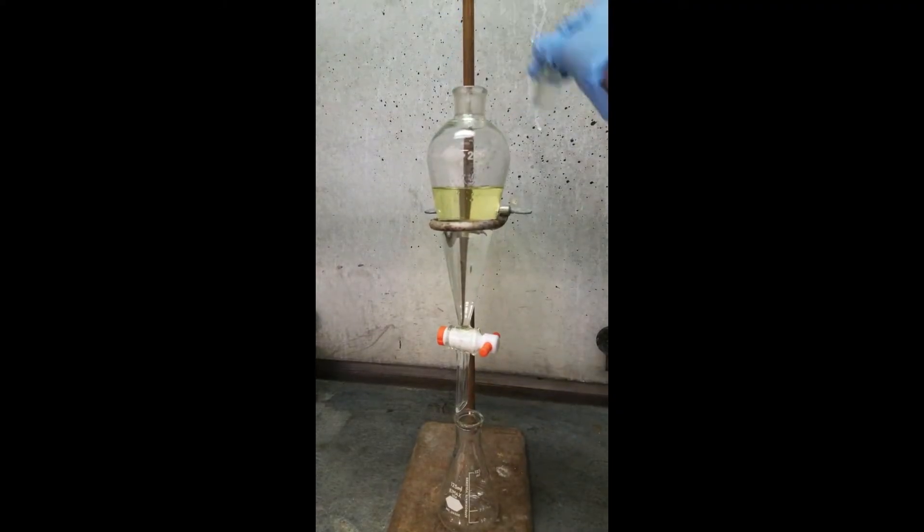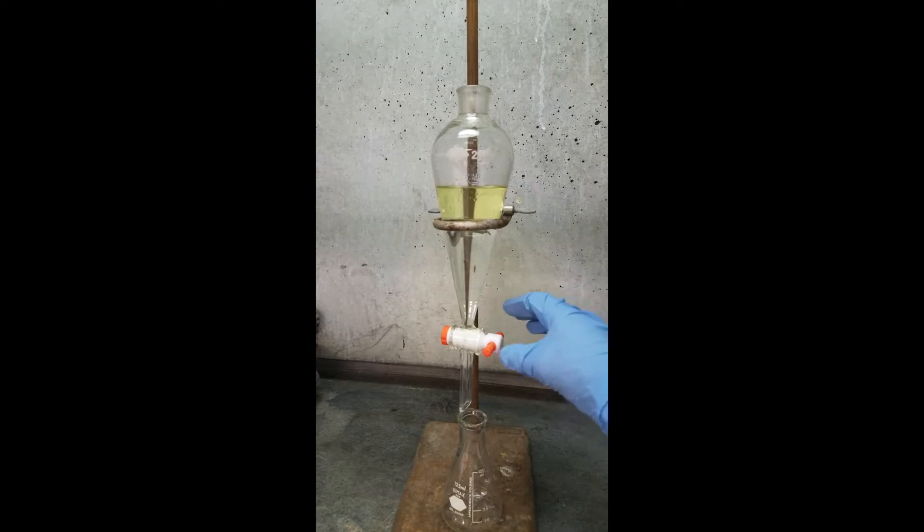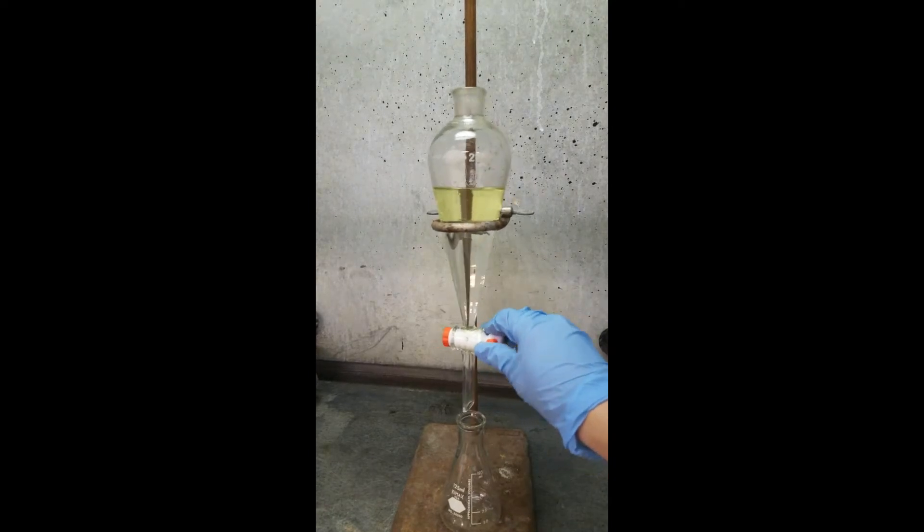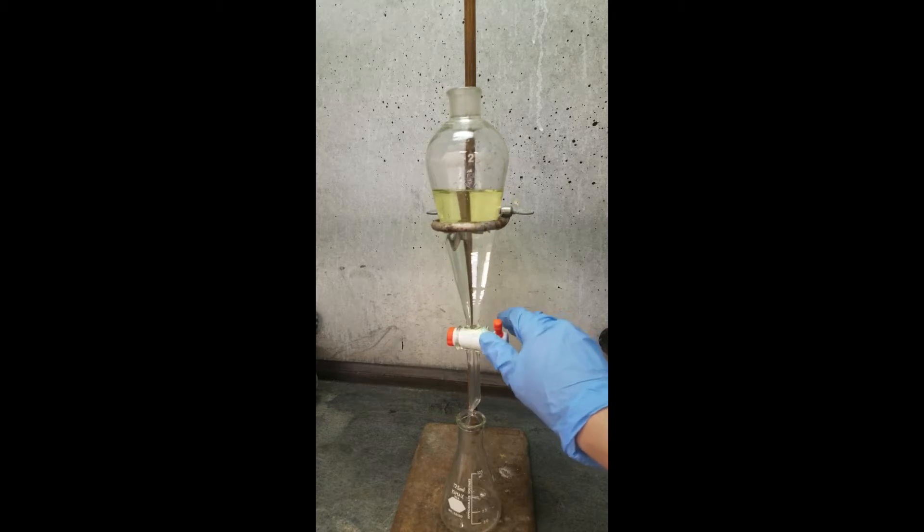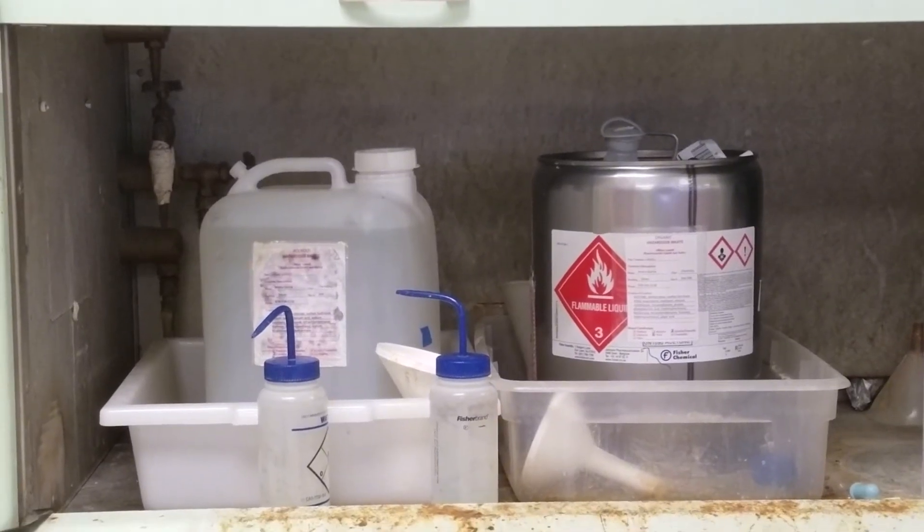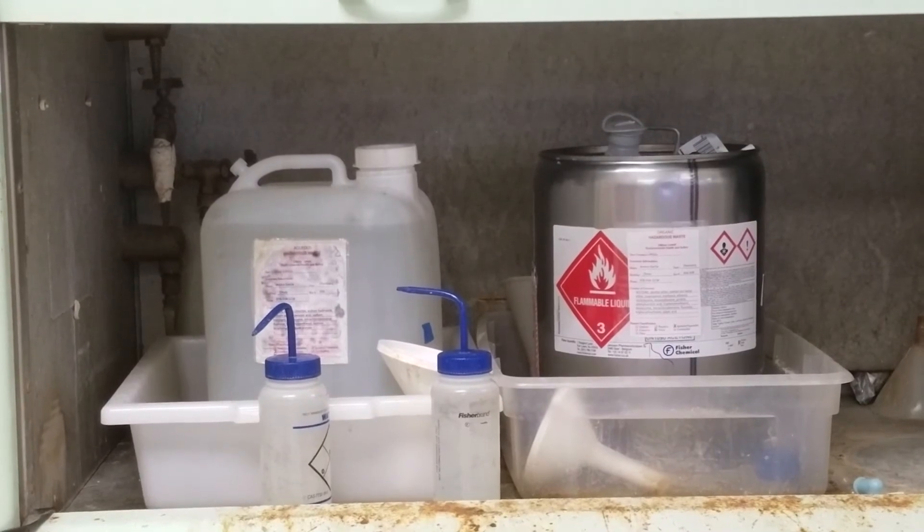Once the layers have settled, remove the stopper from the separatory funnel and drain the desired organic layer from the funnel. Perform additional extractions and washes as necessary. Remember to discard any excess liquid in the appropriate waste container.